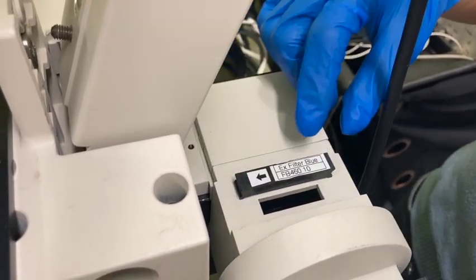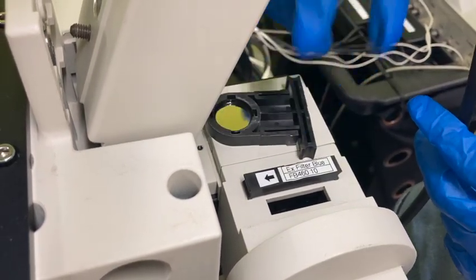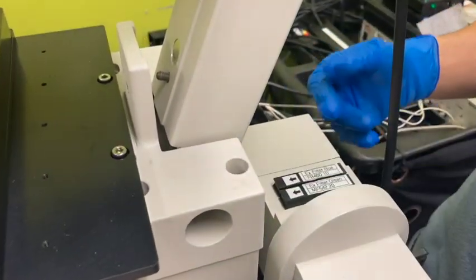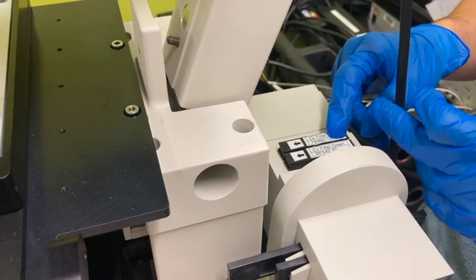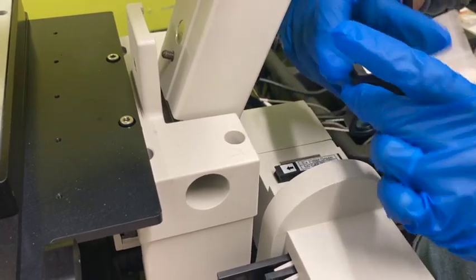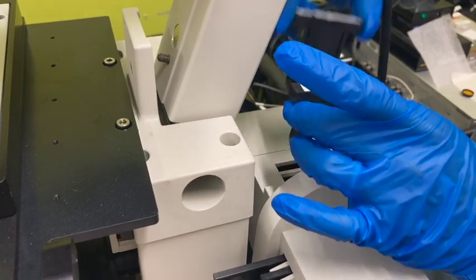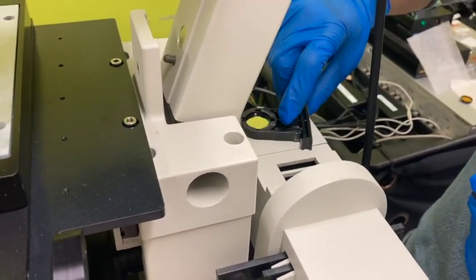If you use blue for the microtubule, just put blue in, and this one is going to be a little bit out. Because if you have both coming in, which means this allows only green and this only allows blue, you have nothing going out eventually. So that's the point. The positions are interchangeable, so you can put these two here or swap them. That's fine.